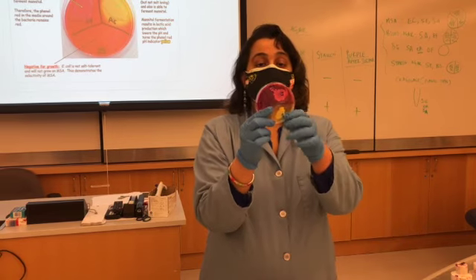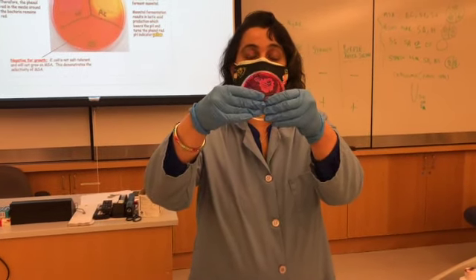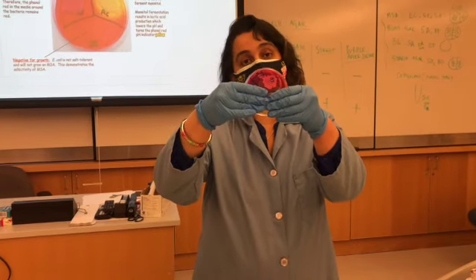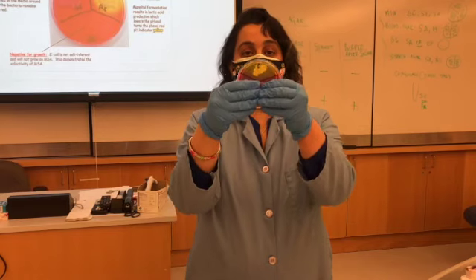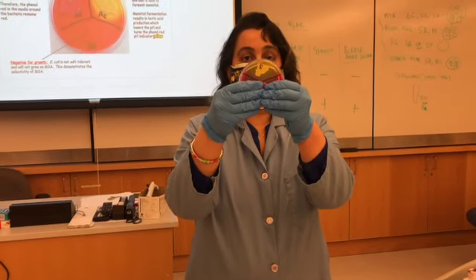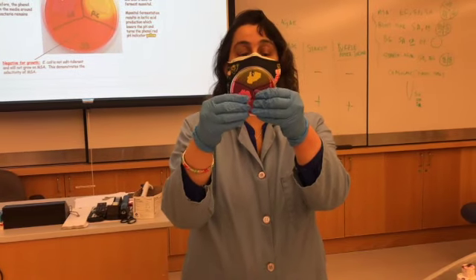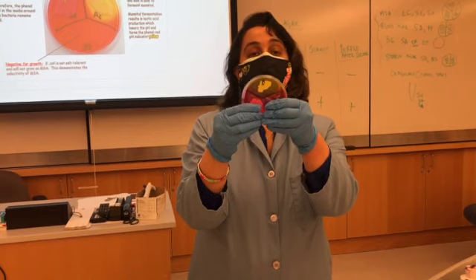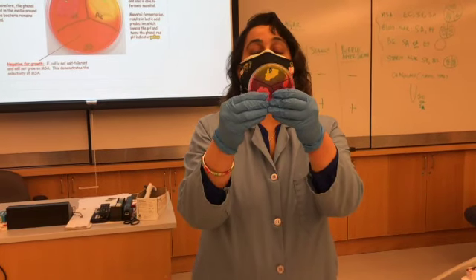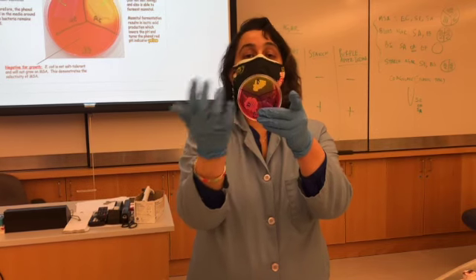That's the reason wherever you have Staph epidermidis, you can see that the color of the media is not changed from red to yellow. But if you look at this area where Staph aureus was added, you can clearly see that Staph aureus has the ability to ferment the mannitol sugar, and it can change the pH, and that's why you see the change in the color from red to yellow.